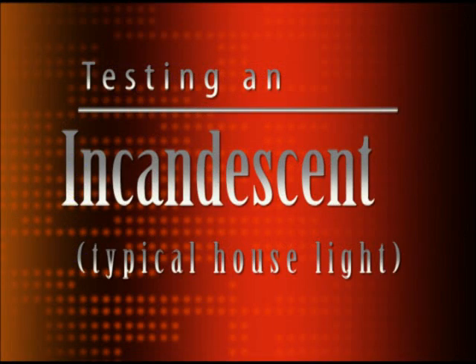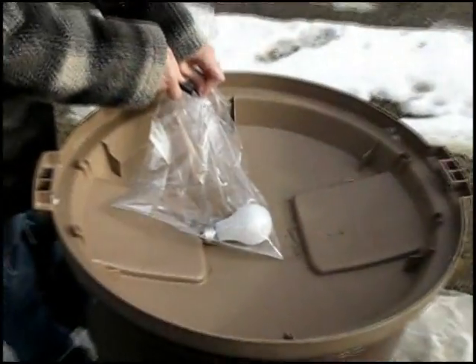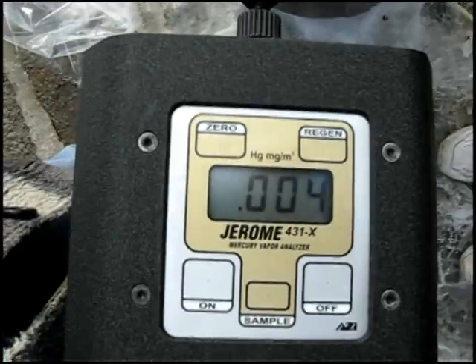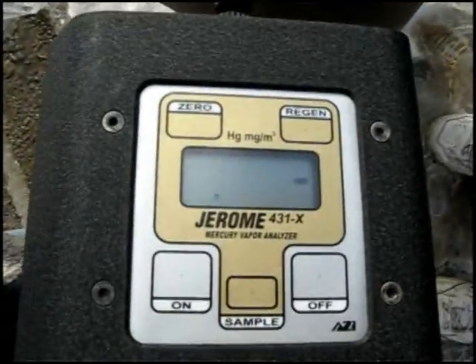So, we decided to move on to the last part of our experiment: incandescent bulbs. We tested a typical 75-watt incandescent bulb by Sylvania. We poked our hole and took our readings. Our first reading without breaking the bulb showed four micrograms of mercury vapor. Our second reading showed zero.